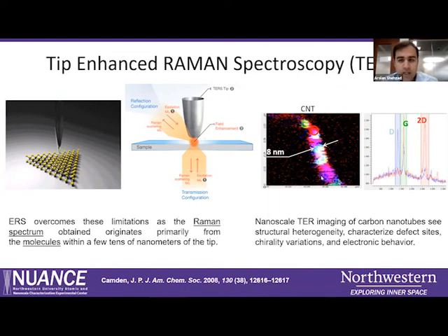TERS will definitely help us, because right now one of the key issues of Raman spectroscopy is that we cannot look into the nanometer scale of the materials. But if we can utilize TERS, then we can look into materials which are a few nanometers in size.